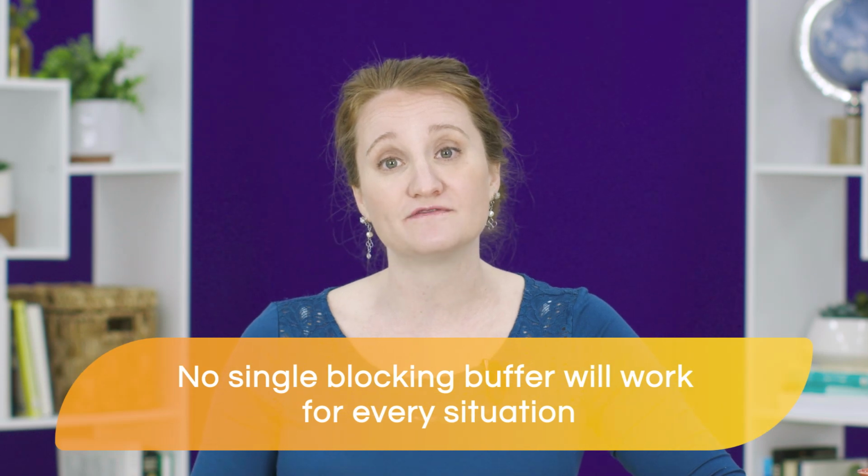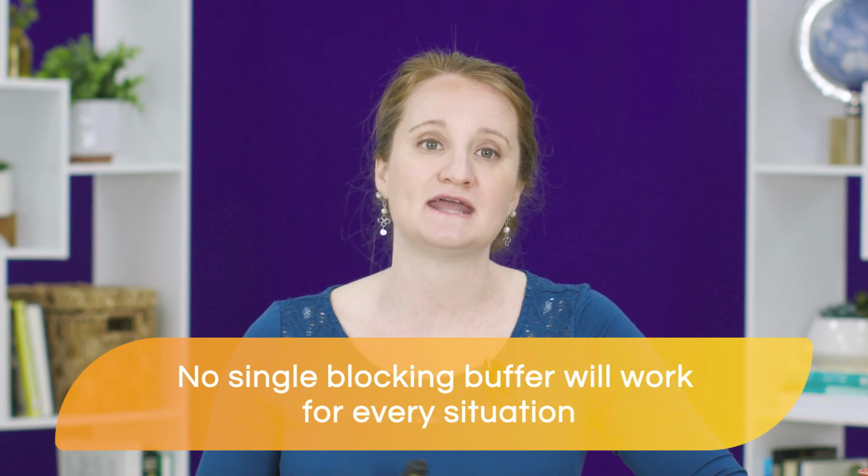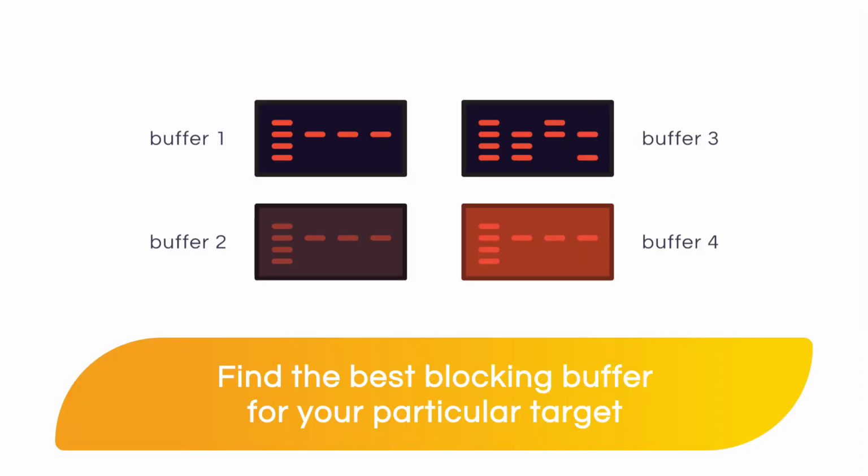Now, most scientists that I work with have a preferred blocking buffer that they like to use for every experiment. And this is great in a way because it makes your protocol simple and streamlined. However, in practice, there really is no single blocking buffer that will work for every antigen and antibody pair. You may have a new target that yields little to no signal on your membrane, or your membrane can appear dirty with a lot of non-specific bands. Therefore, it's really better for each target and sample type that you test out multiple blocking buffers to determine which one is best for your target.